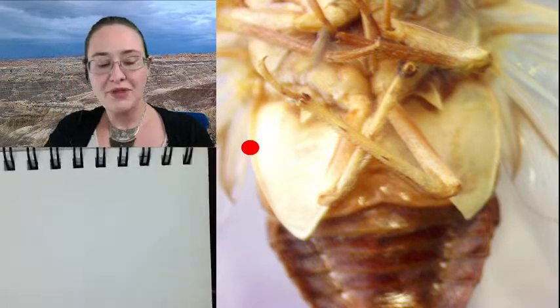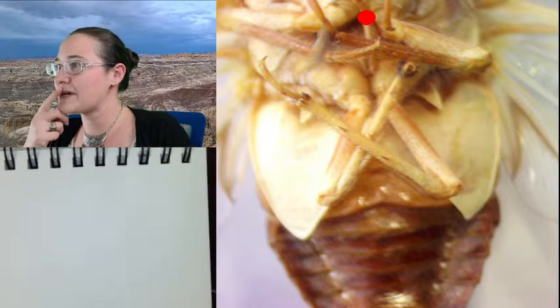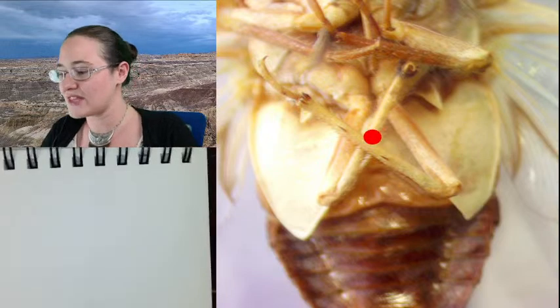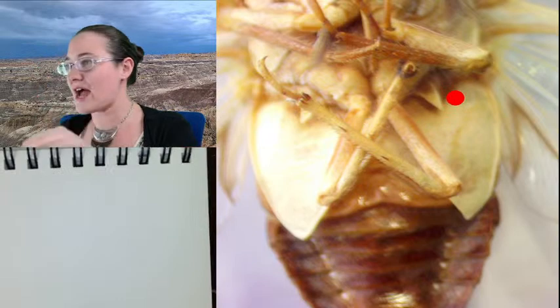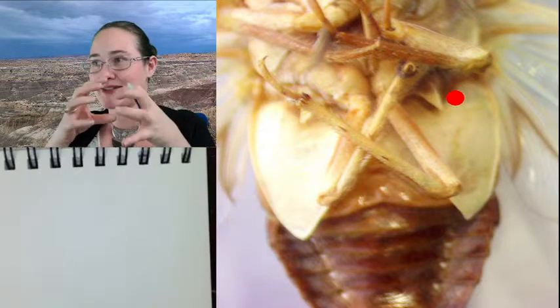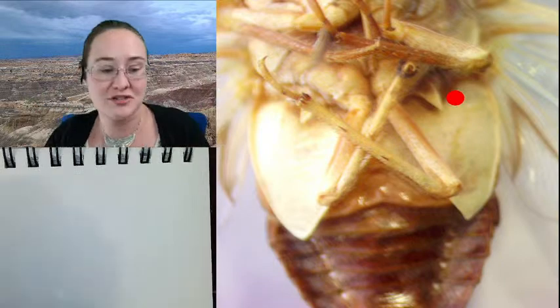So, up here is the middle legs. These are the hind legs right here. The timbals are actually on the abdomen, and then the operculums cover them up. We'll look at them straight on, because you can see they're actually separated from the body to create essentially a resonance chamber to help make cicadas even louder, right?